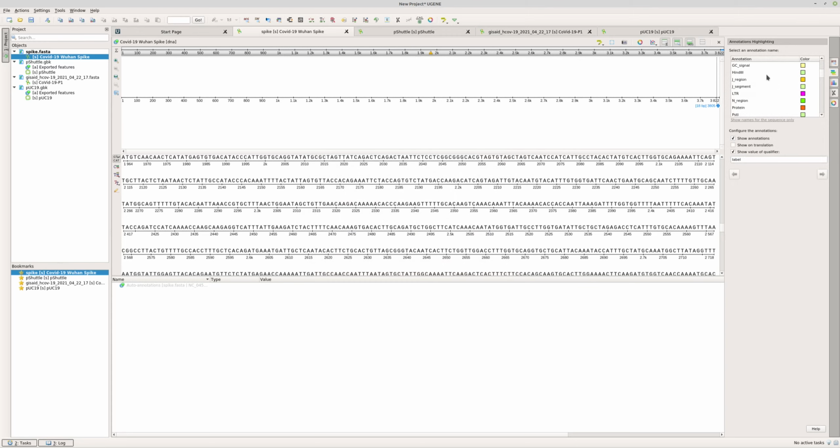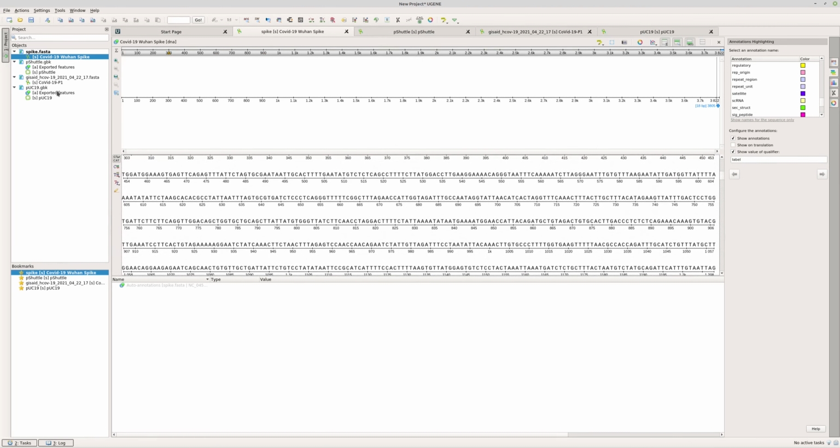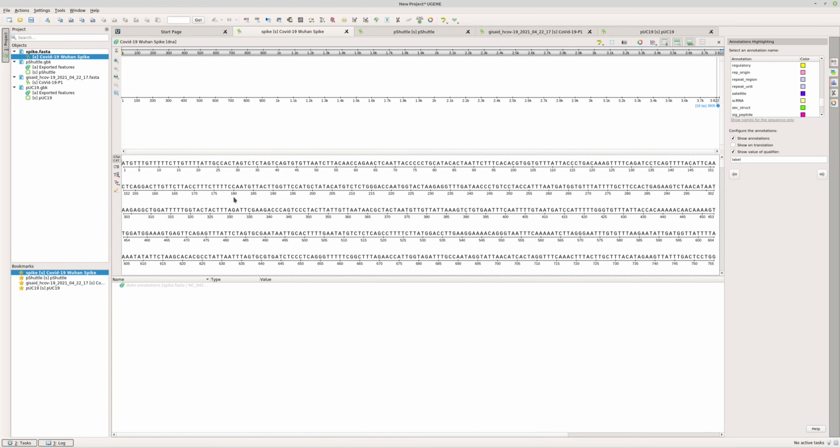Okay, so there's some auto annotations. So going further along, we can think about our capacity to perform a digestion and do some sort of sequence manipulation. And what I mean by sequence manipulation is we would not necessarily have just a DNA sequence like this. It would be in the context of another sample, perhaps even an isolate, or in this case, a cDNA. So we can see that it's spike protein and starts with ATG.